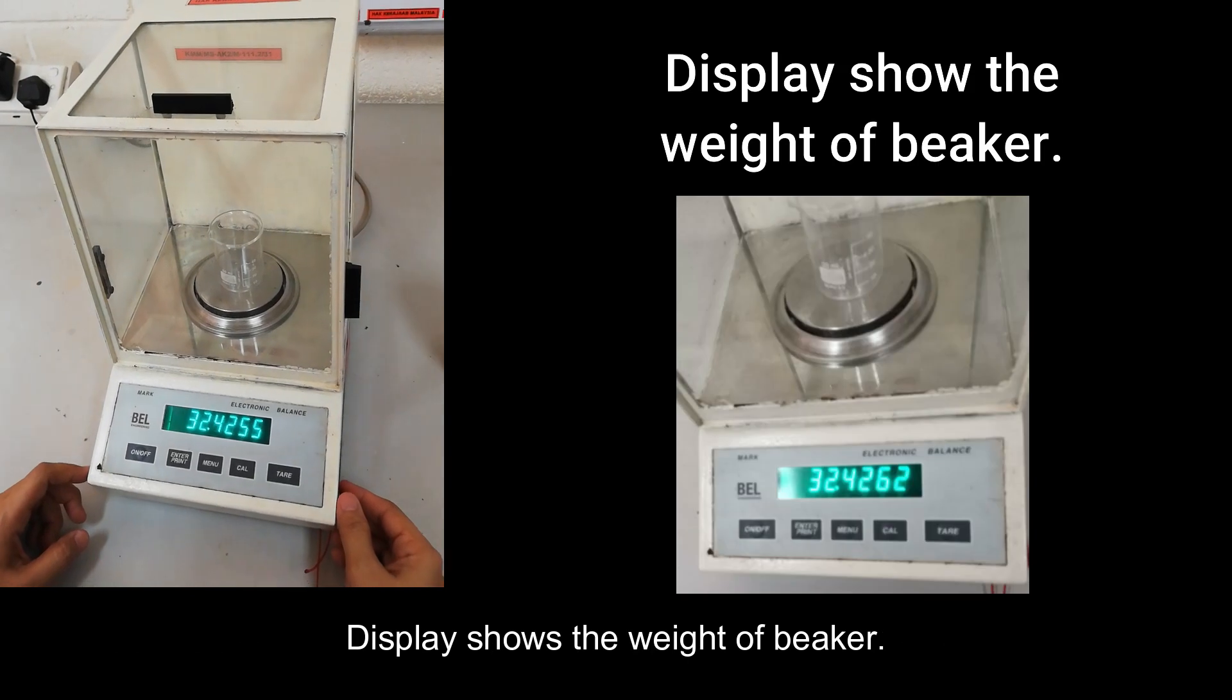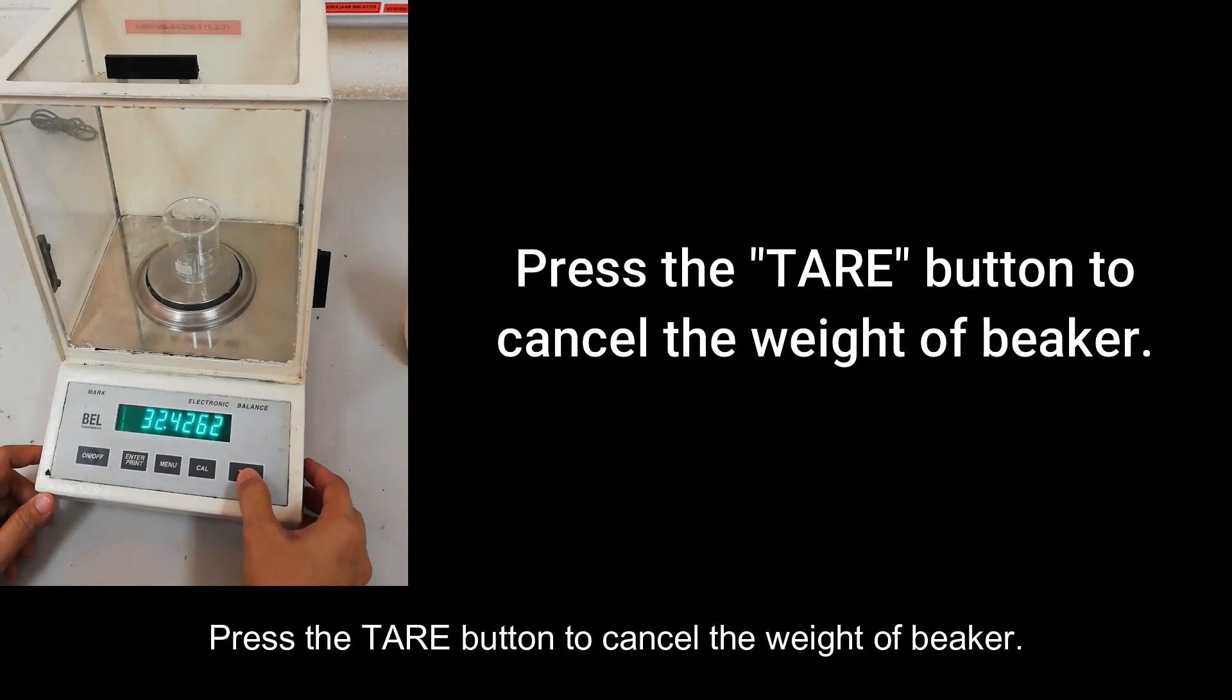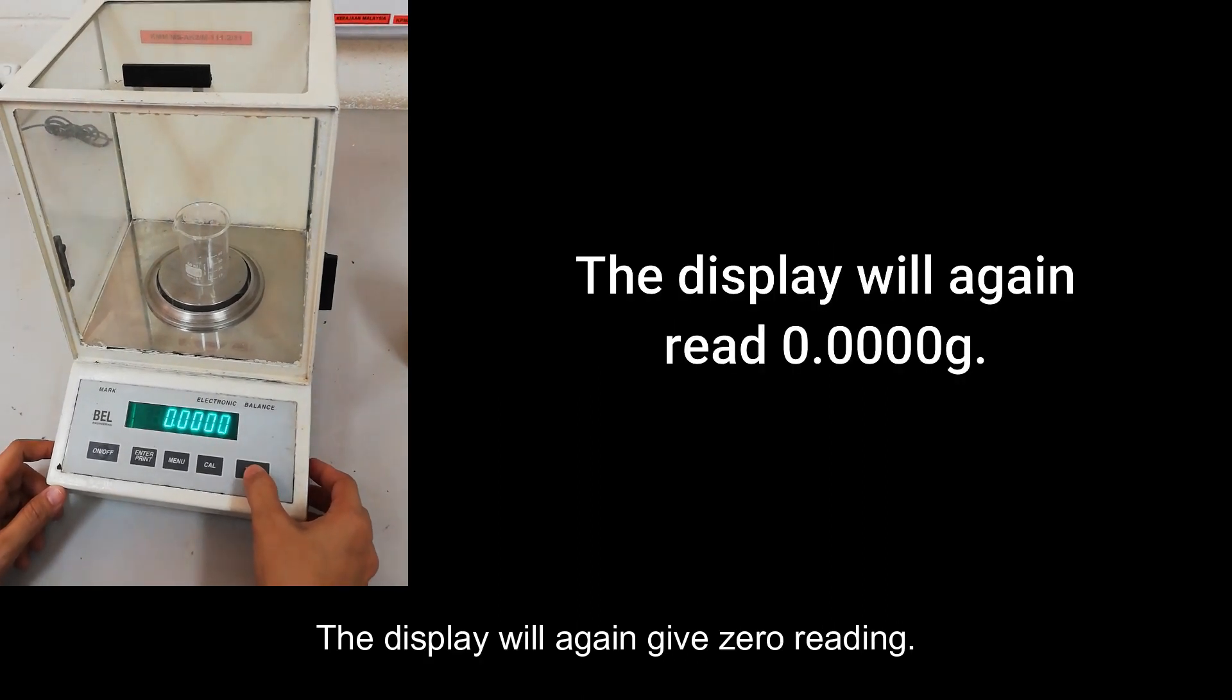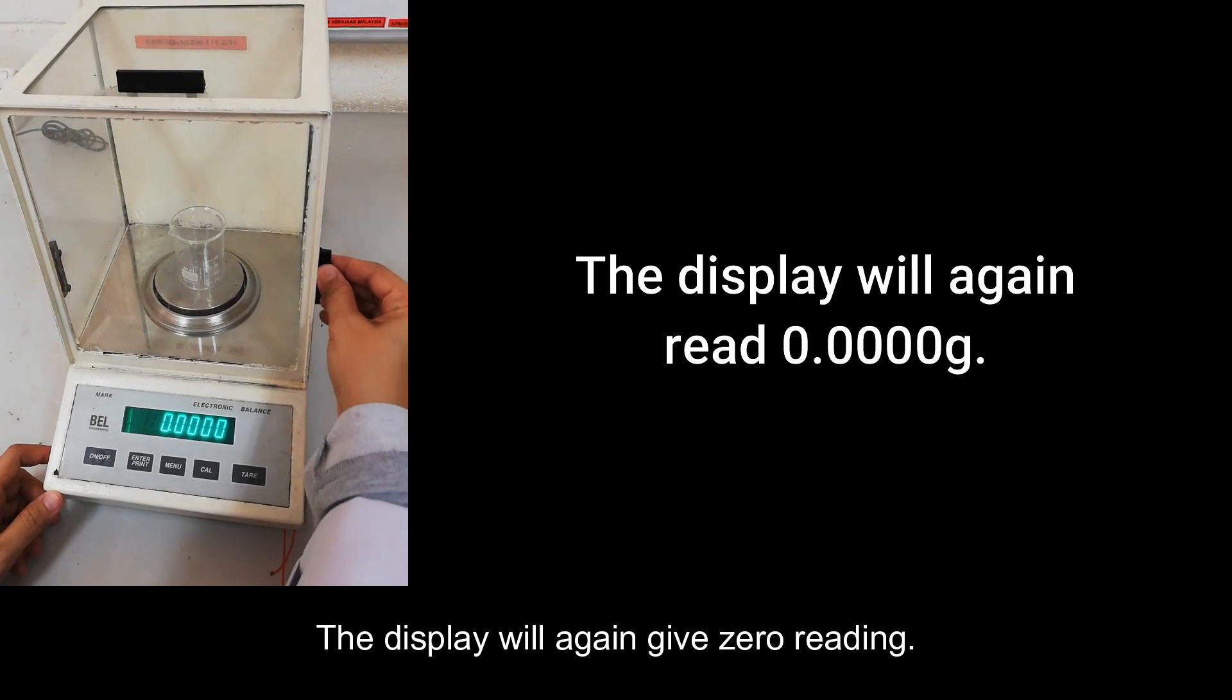Display shows the weight of beaker. Press the tare button to cancel the weight of beaker. The display will again give zero reading.